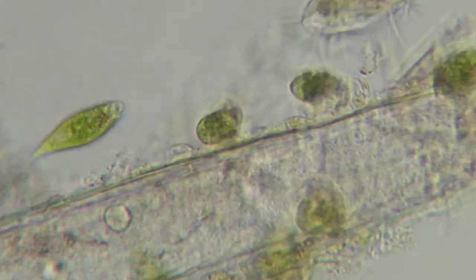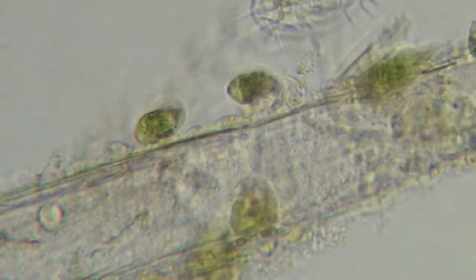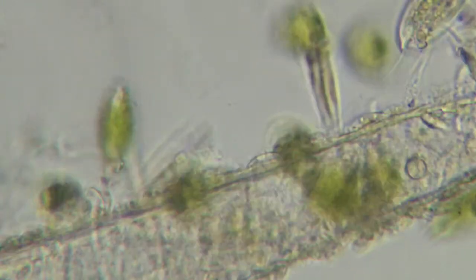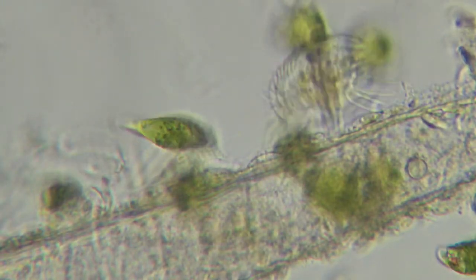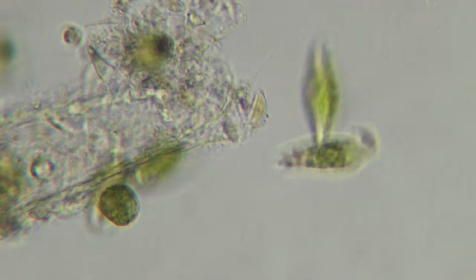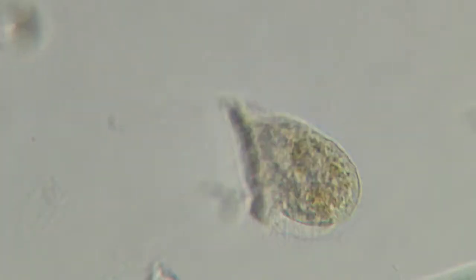Come on, do your walking. There you go. See it turn sideways? The cirri come down, and it's walking. Almost looks like a little microscopic aphid. And back to swimming again. Just so much fun. I could watch them for hours. There's that weird one again that's flexible.